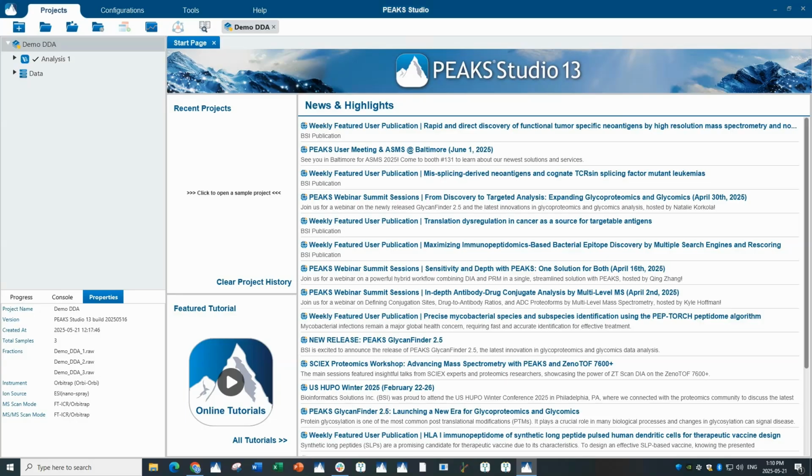The result layout is quite comprehensive, and so we won't be covering everything in detail in this video. Rather, this will be a general overview of the result structure. For detailed explanations of each figure and the contents of each of the result tabs, please see your user manual found within your Peak Studio installation folder.